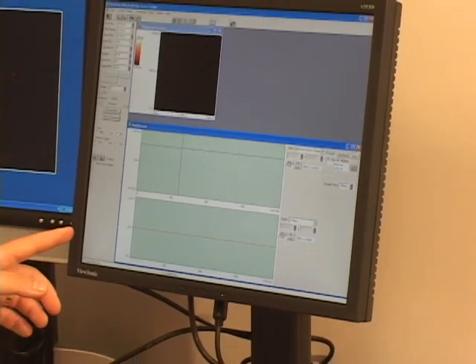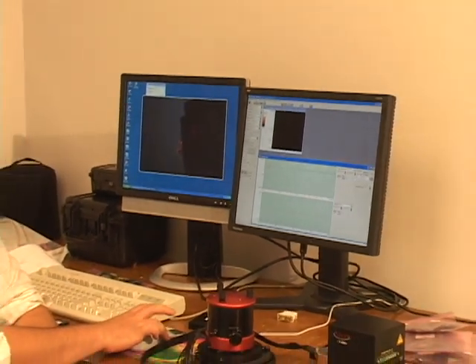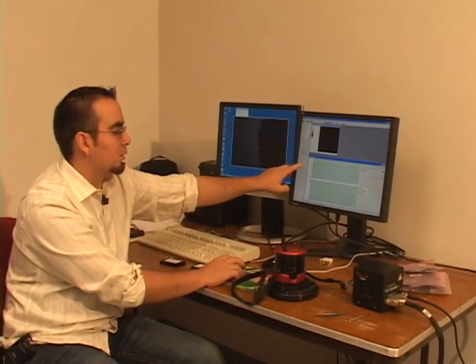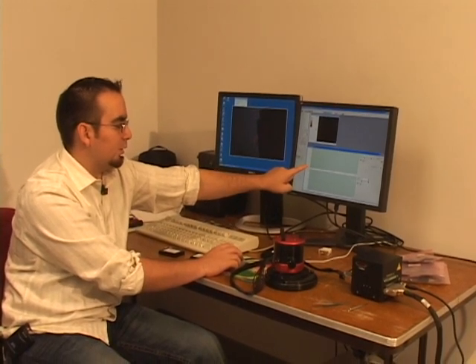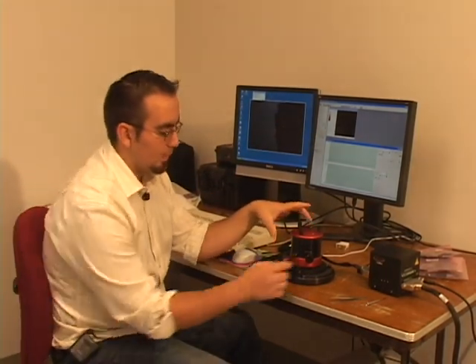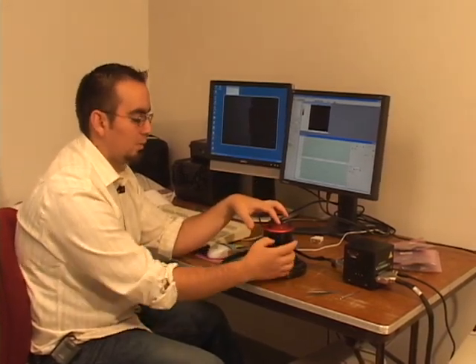Which was about 35 and a half or 35.7. Right click the oscilloscope, click on the detector signal, the left right button. Now we see that the alignment on the left right is way at the bottom. So you want to bring that up. To do so, we use the left right adjustment knob. And if it's at the bottom, turn it clockwise to increase it or raise it.